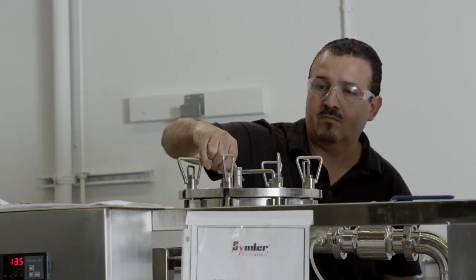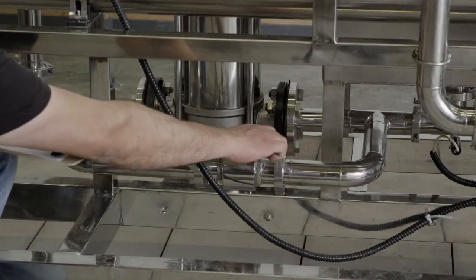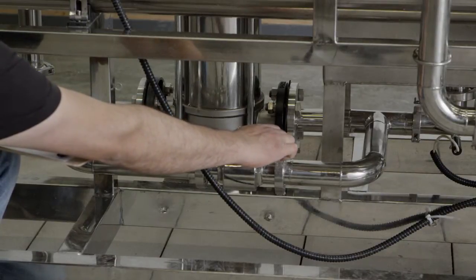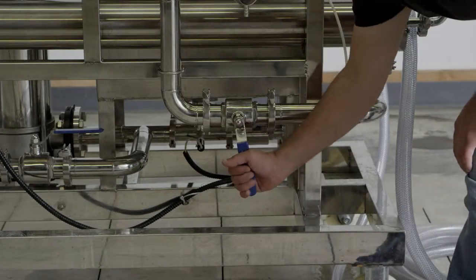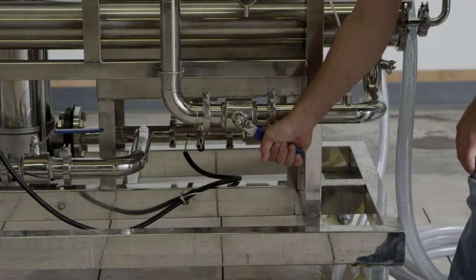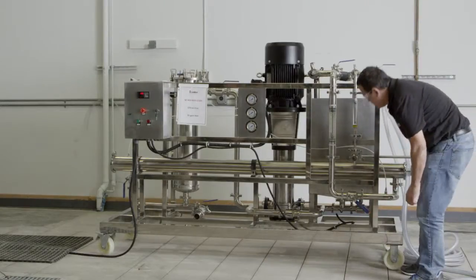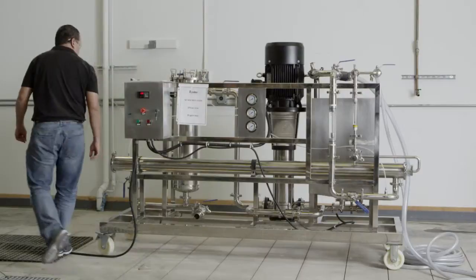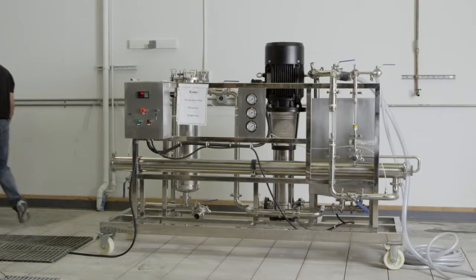You have now primed the system. Now, set the pump throttling valve to one half open. You will then set the concentrate and recycle valves to one half open. This will allow for a soft start when we fire the system online. You never want to start the system with all concentrate and recycle valves fully open, because you can water hammer the elements and cause physical damage.